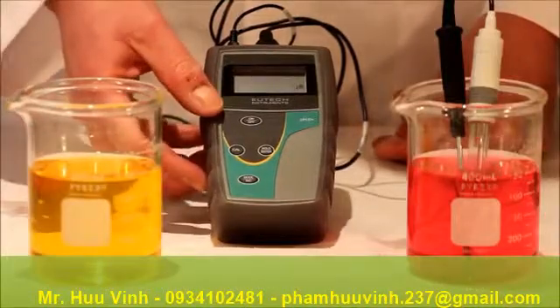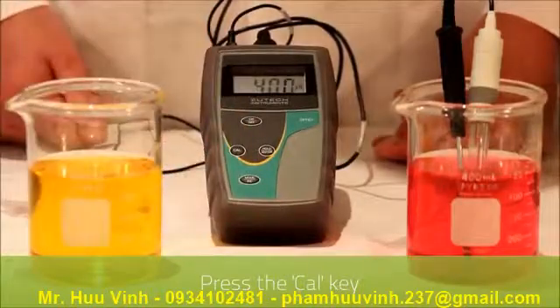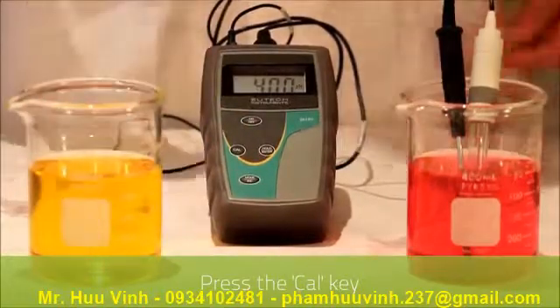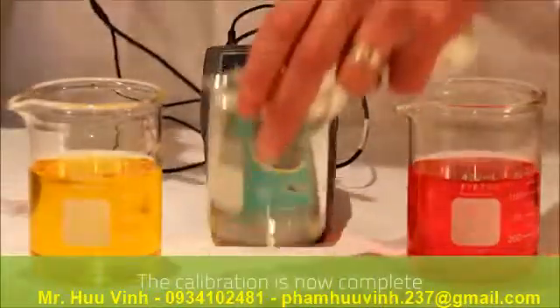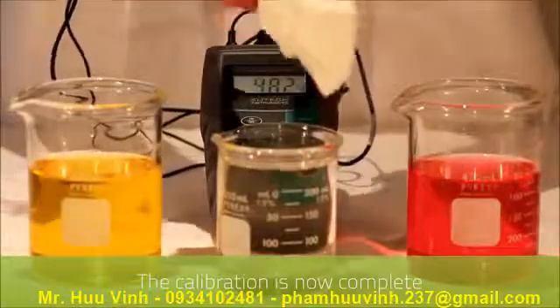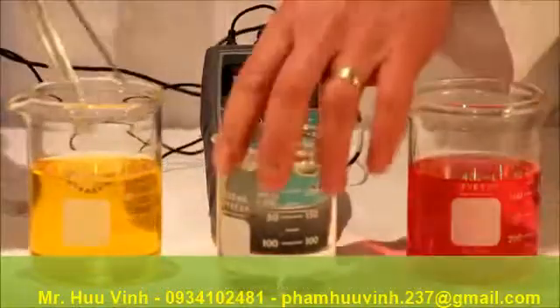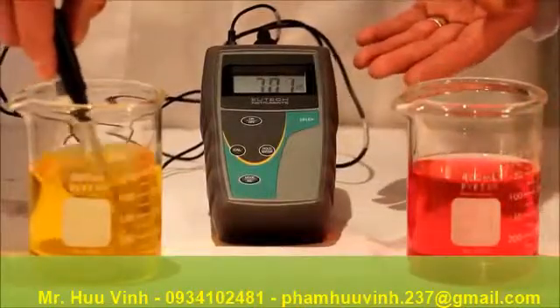To end this process and enter back into measurement mode we press the CAL key. As you can see the measurement is correct in 4 and we will clean in DI water. Submerge into 7 and we have the correct reading.